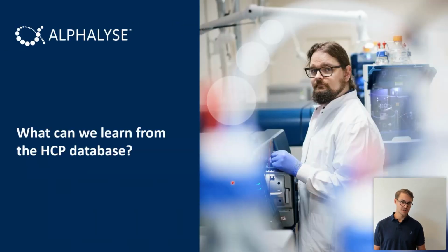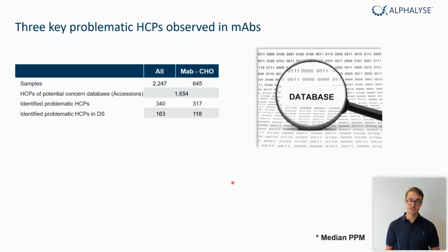So what can we actually learn from this host cell protein database? We have all of this data, which is shown to be very precise and reproducible, and we can compare this across different projects and actually learn about these individual proteins. And I'll show you some different case studies and some different examples that we have used it for. So one thing is problematic host cell proteins, and specifically in mAbs.